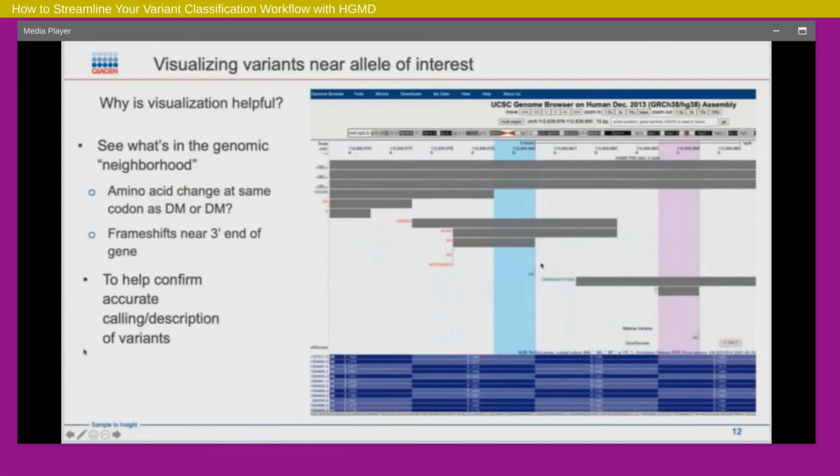As a person reviewing this variant and maybe examining the BED file or the BAM reads, I might suspect that this insertion is in fact supposed to be called here, a few bases away, downstream. In repetitive regions, sometimes there can be changes in how it's represented in the VCF versus HGVS.